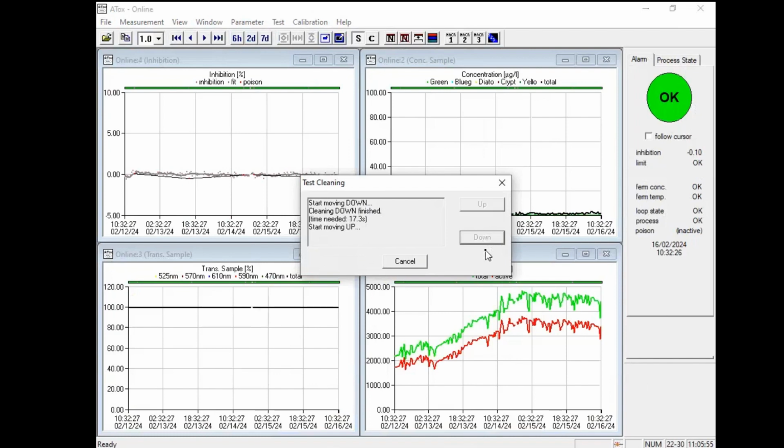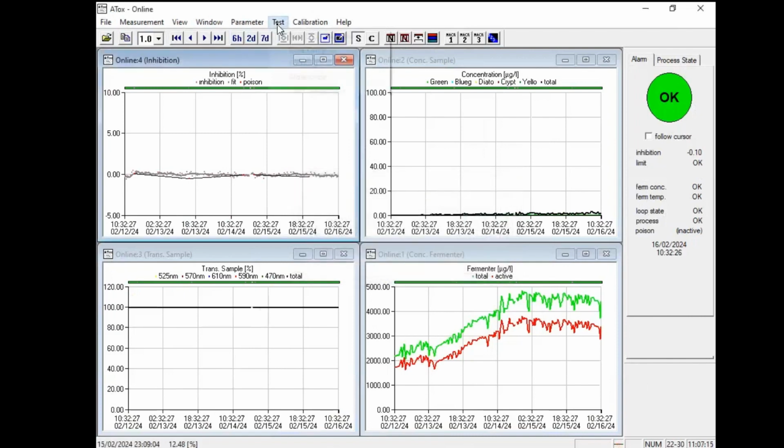Why do we have a test facility for this? If you have a very long time no maintenance, maybe the O-rings which are used for the cleaning may be very rough, and maybe at a bad time it really got stuck, or it takes too long to move. So this is a possibility to test the cleaning device. That is no longer valid. Okay.